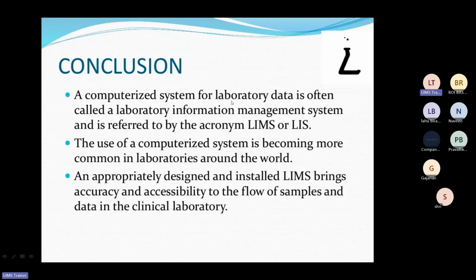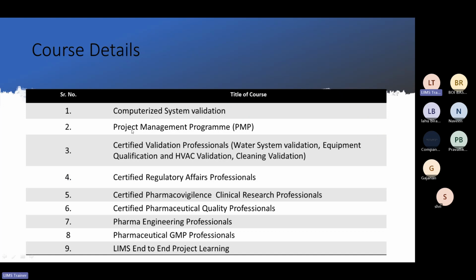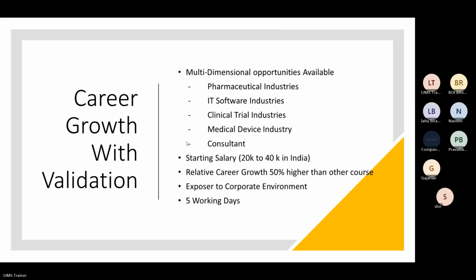The computerized system for laboratory is often called LIMS. Okay, this is very basic. And see, these are the different courses that are provided by the company Connect Consultancy. So I'm going to explain the LIMS end-to-end project learning. If you want any other courses, for that also you can register. Then how is this going to help you?